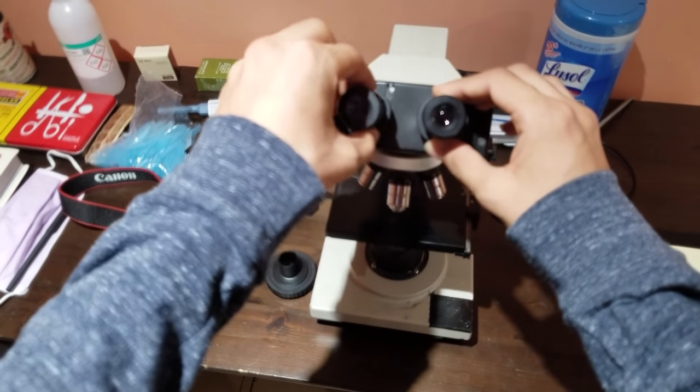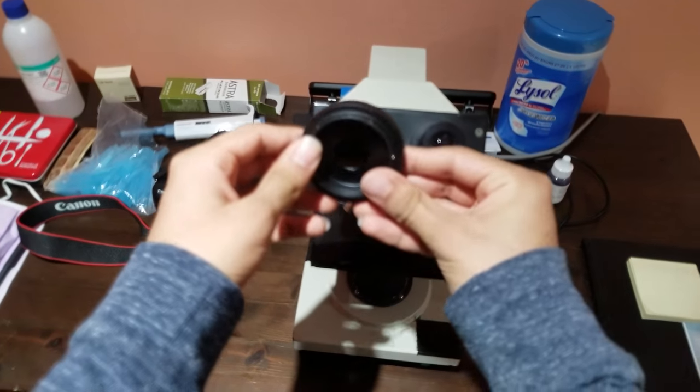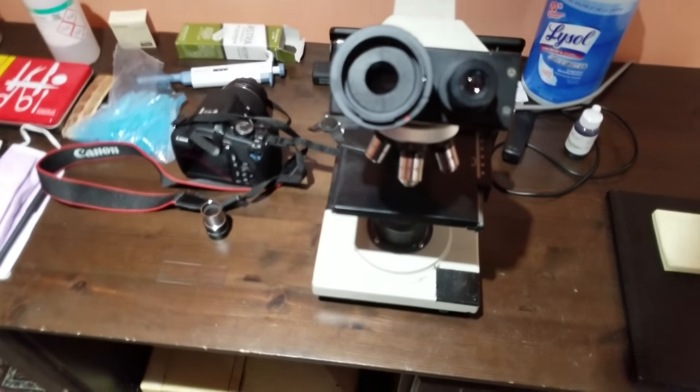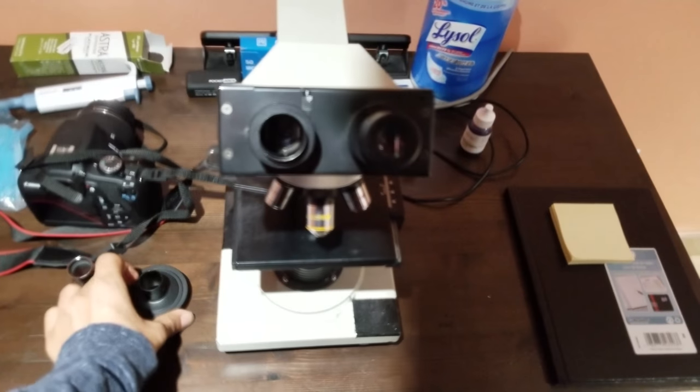So the first step is to take your eyepiece off and put it aside. And then you take your T adapter and make sure that it fits perfectly inside that eyepiece socket. And this one fits perfectly, so we can just take it out and put it aside.